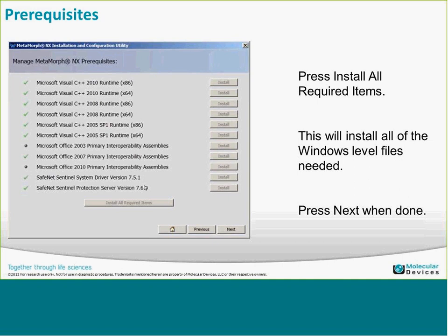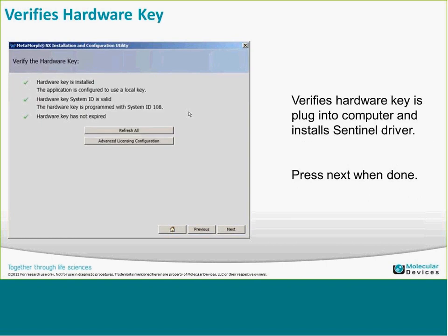The next step is to verify the hardware key. It will check that the key is installed, that the system ID is valid, that the key has been programmed with a specific number, and that the key has not expired.